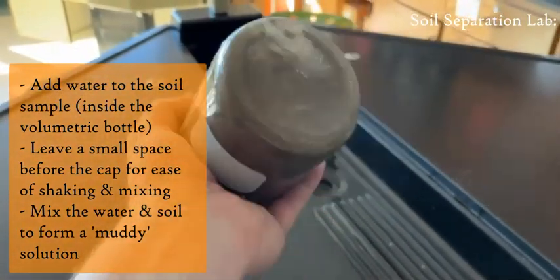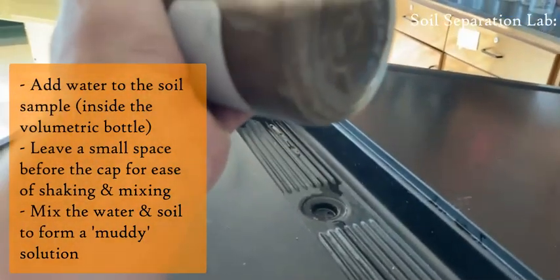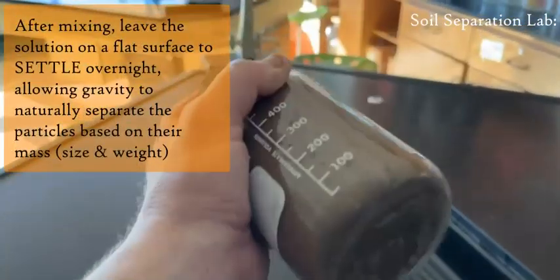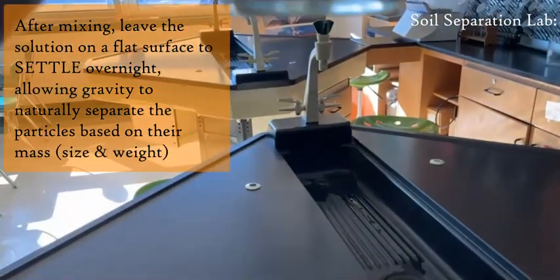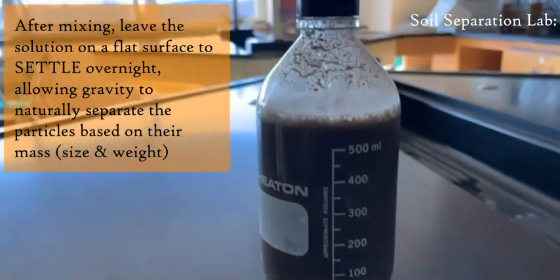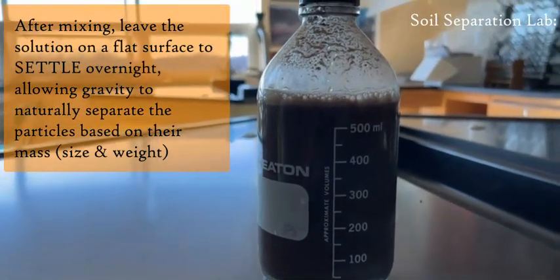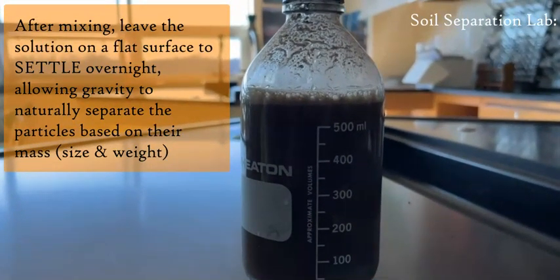And then what you're going to do is you're going to leave it overnight or over a certain amount of hours for it to settle and let gravity do its thing, and that will naturally separate the three components: the sand, silt, and clay. The sand is the larger, heavier particles that will sink to the bottom. Then you have the silt, and then finally the clay, which is the smallest and lightest.